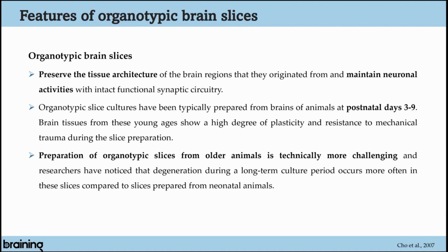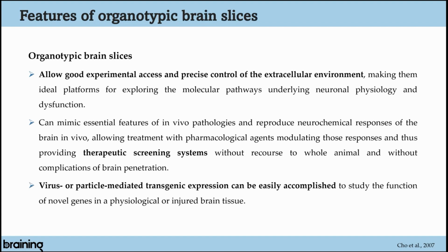I'm not saying that you cannot prepare these organotypic slices from older animals. It's definitely much more challenging, and researchers have indeed noticed that the degeneration that occurs during long-term culture is increased in relation to the slices prepared from 1-week-old animals.